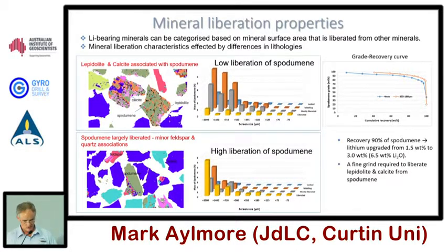And we can go further and plot up grade-recovery curves, which is very important on the beneficiation side of things, in terms of flotation, to work out theoretical recovery curves, and then you'd back that up with your test work program.